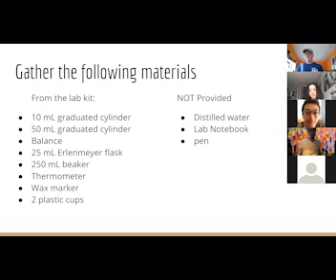Oh, that's too much. But what you can do with this is fill it with water and then put it in drop by drop. That makes it a lot easier. I'm surprised it's not on here, because it'll make your life much easier. So see if you can find it. It's called a transfer pipette. So you squeeze it. Here we go. You squeeze it from the top, blows out water. Then you let the water come up, and then you basically just squeeze it again to let it go out the bottom. So highly recommend it.